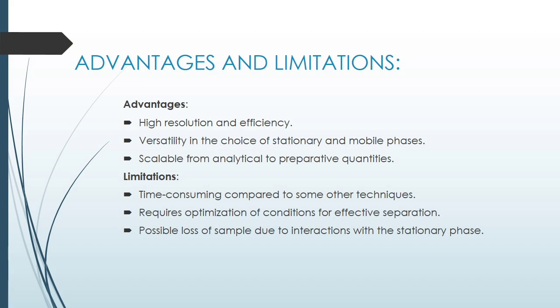Advantages: high resolution and efficiency, versatility in the choice of stationary and mobile phases, scalable from analytical to preparative quantities. And limitations: time consuming compared to some other techniques, requires optimization of conditions for effective separations, possible loss of sample due to interaction with the stationary phase.